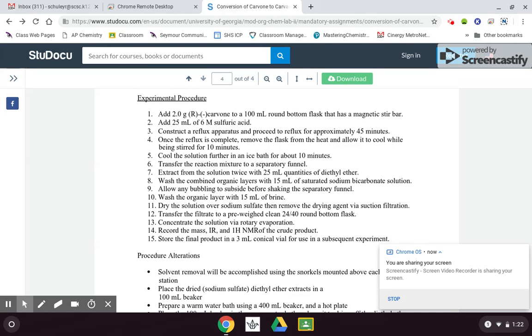So you will just very simply, in a hot water bath, in a beaker, will probably be the easiest. Sit there. You might want to run a little air, but be careful. The boiling point of your liquid is tremendously different than the boiling point of ether. And remember, a hot water bath should be enough to boil the ether off. So just have a nice hot water bath. It could probably just be warm water. You could probably get by with hot tap water.